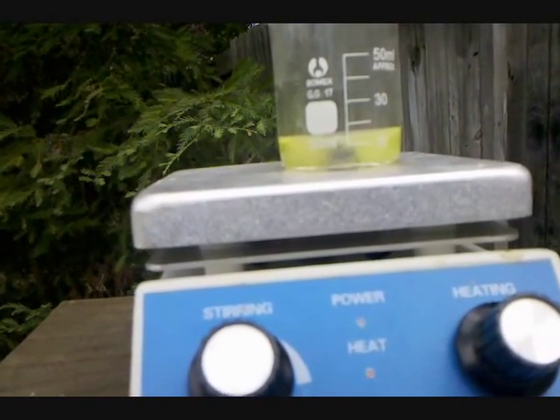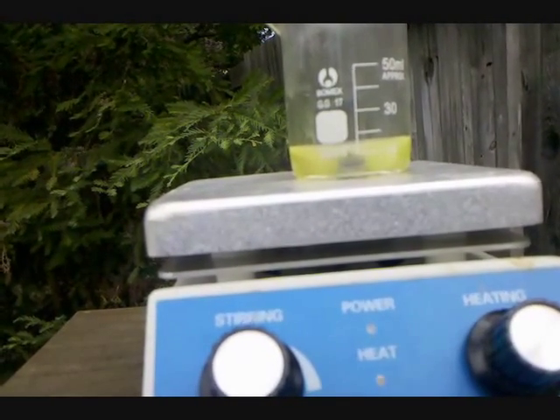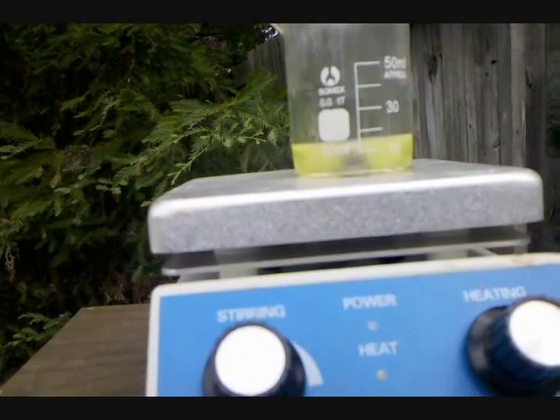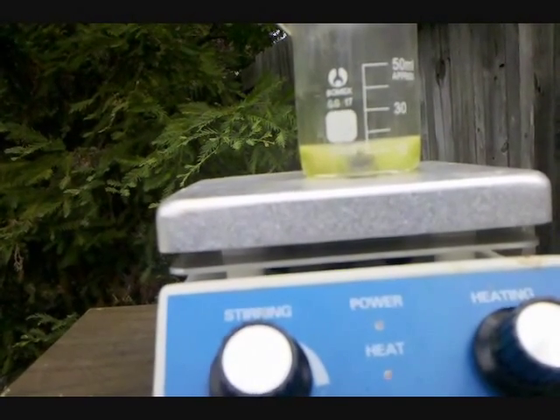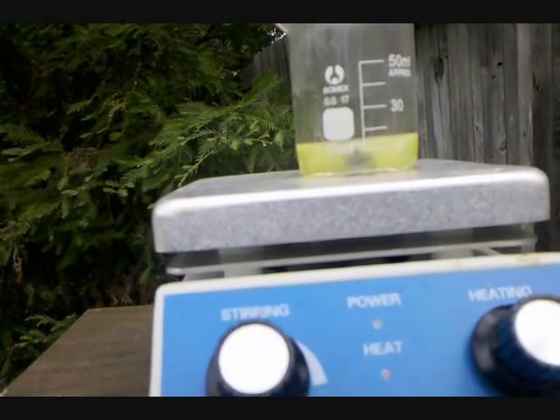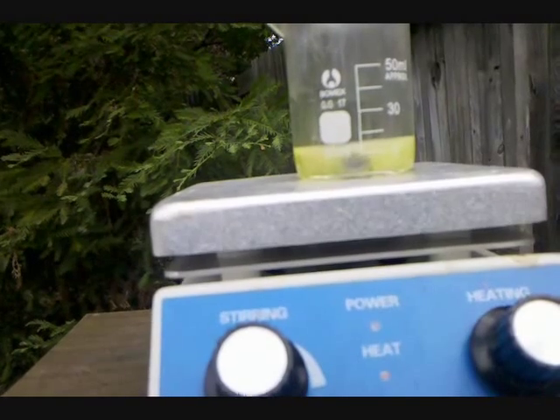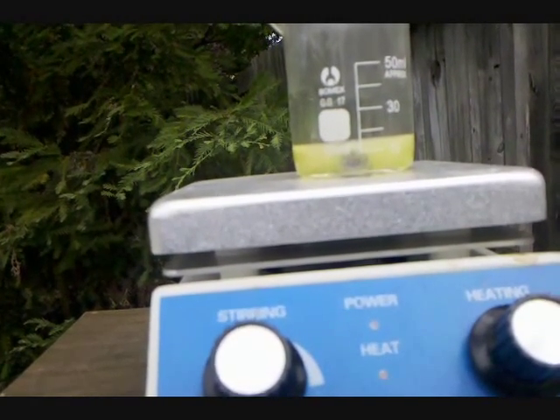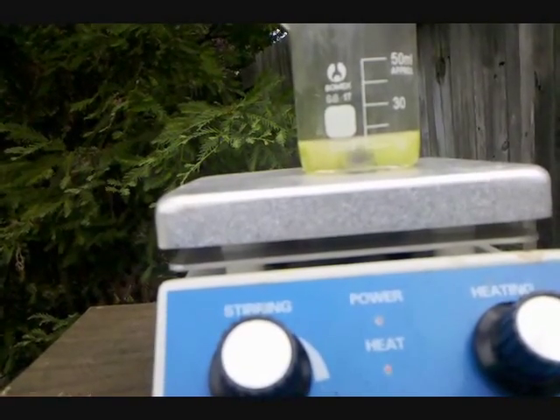Once the Bismuth fully comes to a stop on bubbling, I'm going to take it out and precipitate out Bismuth Oxide with Sodium Hydroxide. Similar to the way that Silver Nitrate reacts with Sodium Hydroxide to form Silver Oxide, Bismuth Nitrate reacts with Sodium Hydroxide to form Bismuth Oxide. So I'm going to prepare a solution of rather strong Sodium Hydroxide, and add it to the beaker.